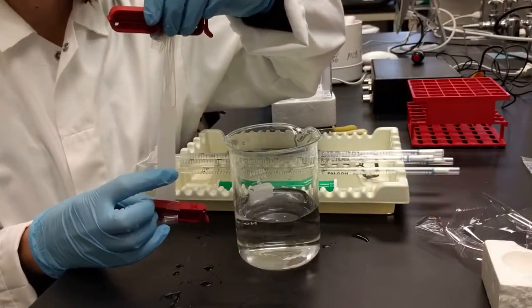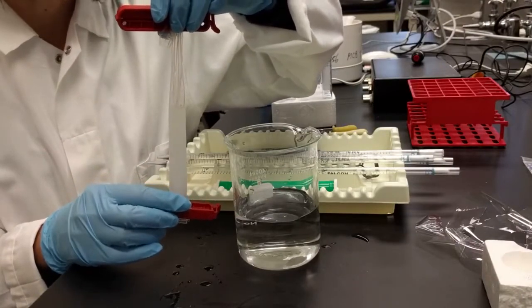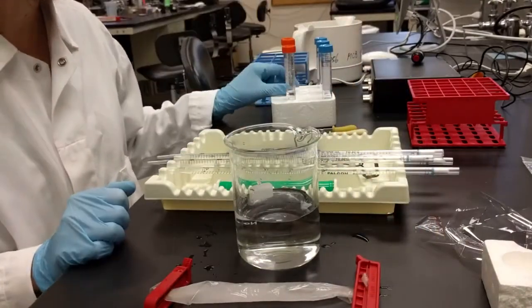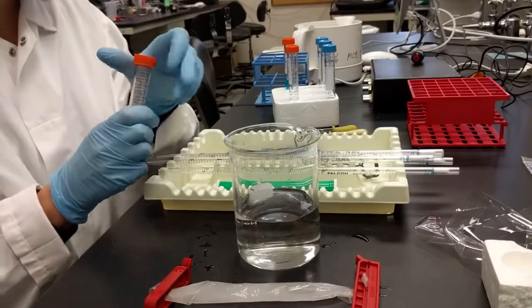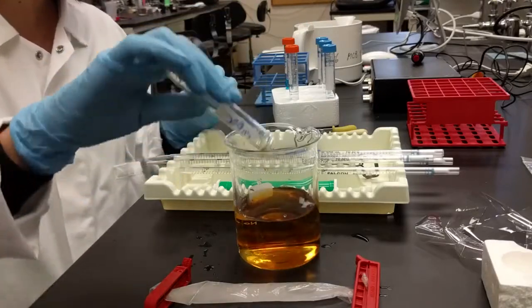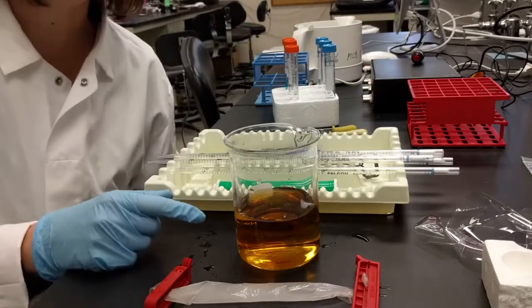Take a look at the color here and write it down as the initial color in the bag in your table. Okay, so then to our beaker of water, I am going to add the iodine potassium iodide, so this yellow stuff here. I'm just gonna dump the whole thing into the water so it's nice and yellow. Okay, so inside of the beaker we have the water and the I2KI.